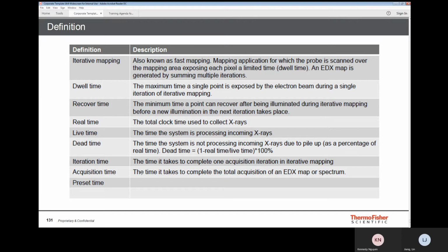Especially when you do heating experiments, when the temperature gets high, you get a lot of infrared noise to your detector. In this case, the dead time is going to be super high. When you go to high temperature, you're going to have infrared radiation hitting the detector.